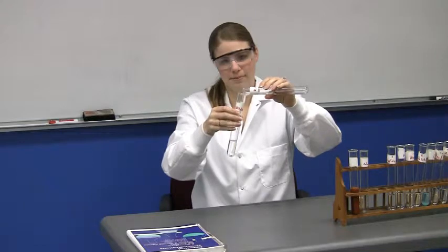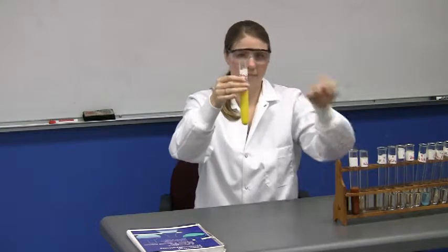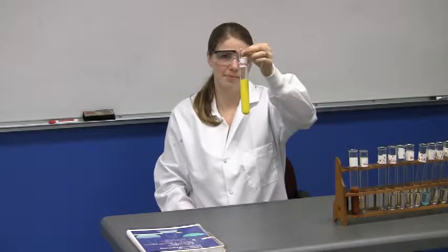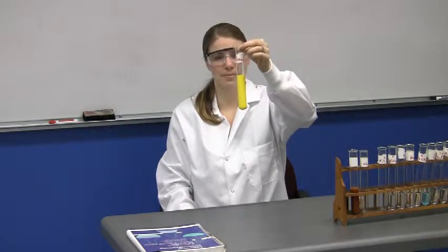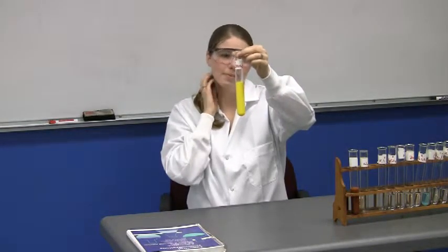All right, next she's going to mix Pb(NO3)2 and KI solutions. And this gives a very vibrant yellow solid as a result. Notice that in both of these reactions so far, the test tubes, before they were mixed, contained solutions that look just like water. After mixing the solutions, again you see a precipitate. So once again, they complete the equation. They use the solubility rules to figure out which of the possible 2 products is responsible for that precipitate.